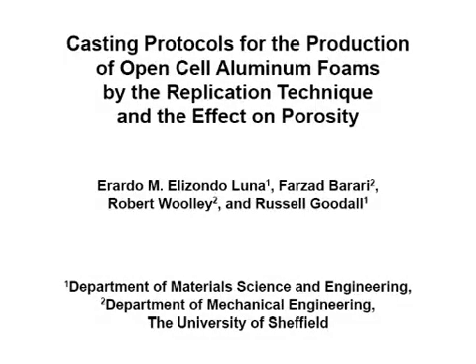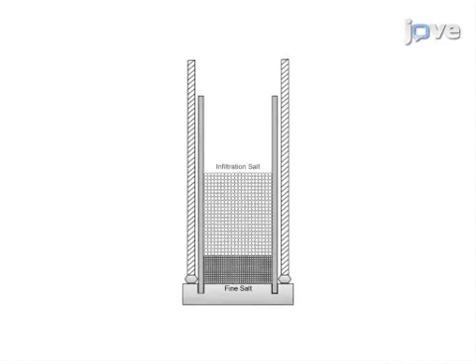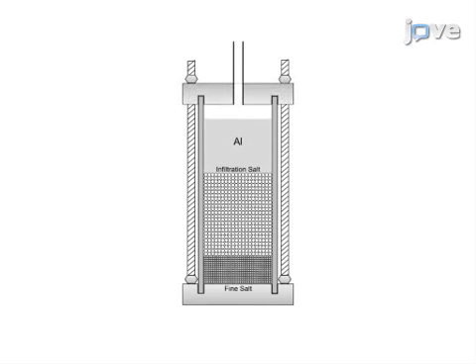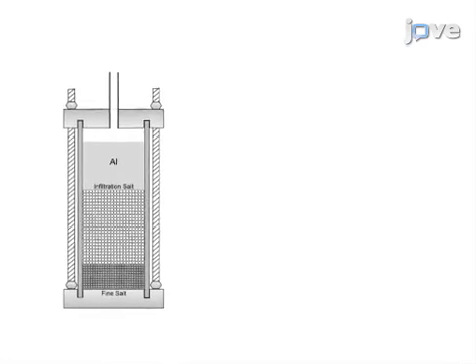The overall goal of this procedure is to produce a metal foam by the infiltration method. This is accomplished by first loading a mold with fine sodium chloride at the bottom, infiltration sodium chloride in the middle, and an aluminum bar on top, then placing the lid on the chamber.